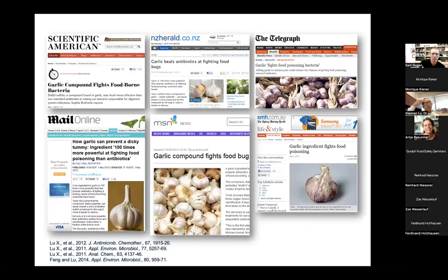And back to another research field, where we use Raman to study the antimicrobial effect. About 10 years ago, we identified a lot of organosulfur compounds from garlic. And we saw that those organosulfur compounds from garlic have a very significant antimicrobial effect. And we want to study the mechanism, how those volatile organosulfur compounds can inactivate the pathogenic bacteria.